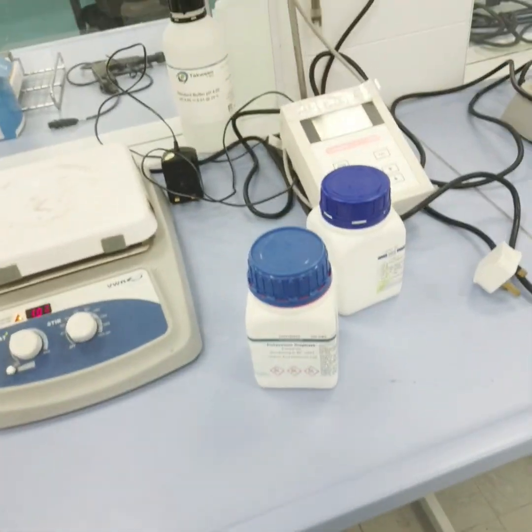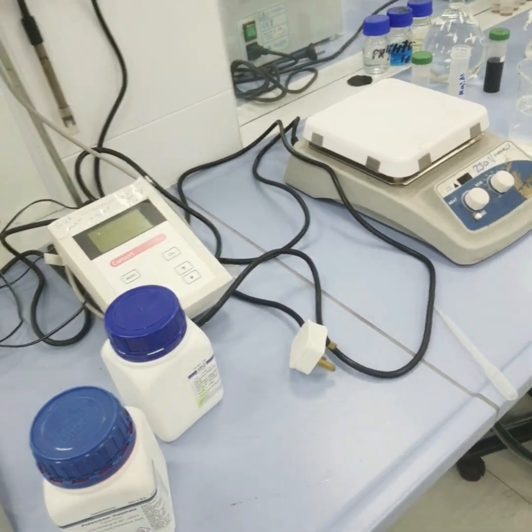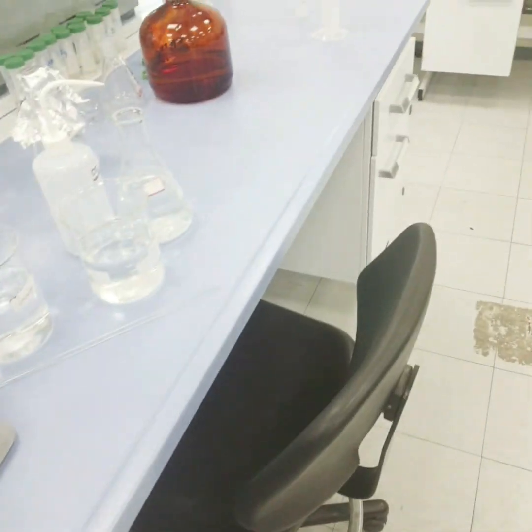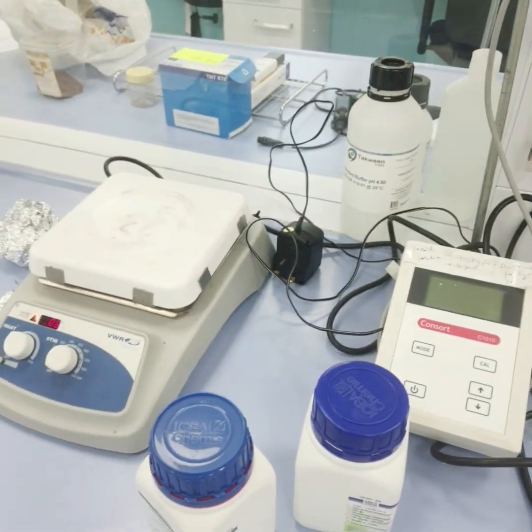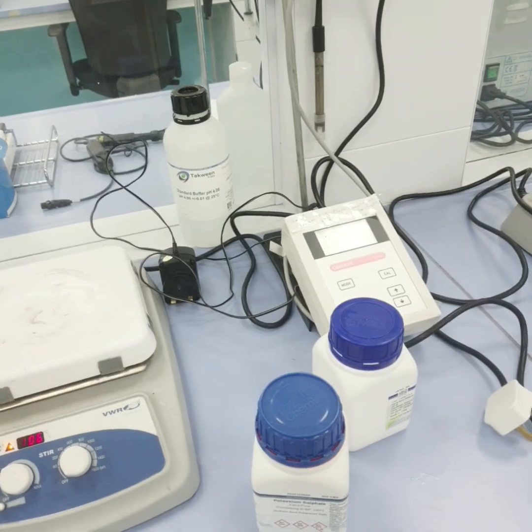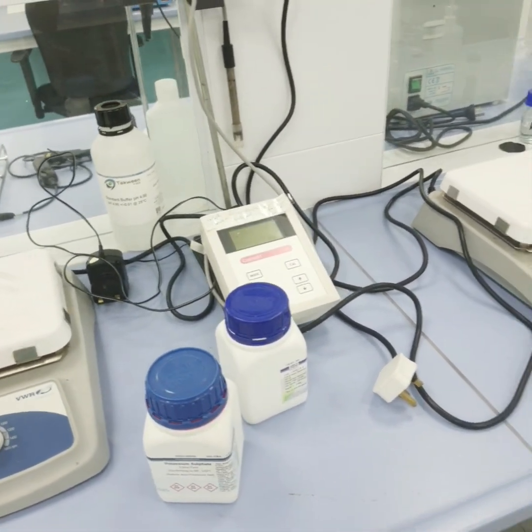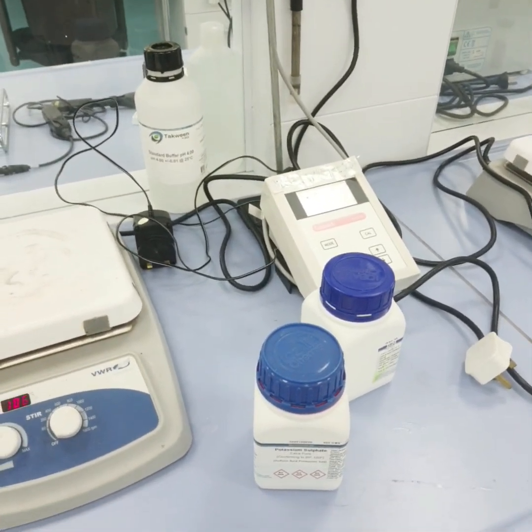Hello friends, today we are going to do hardness of the water. So hardness of the water is because of the presence of divalent cations, mainly magnesium and calcium, and other trace metals also, but predominantly these divalent cations or double charged metal ions.